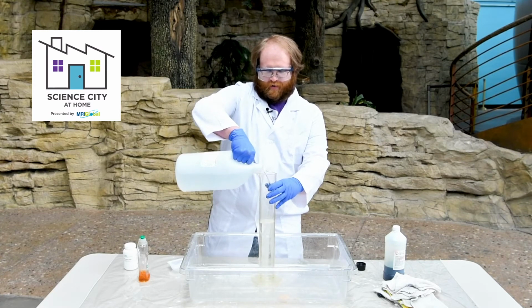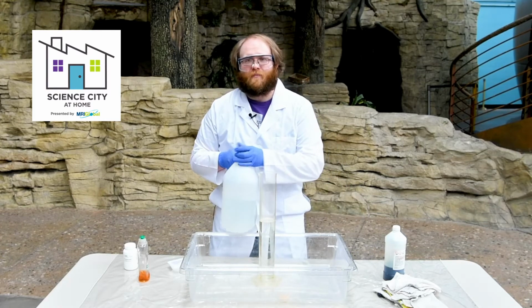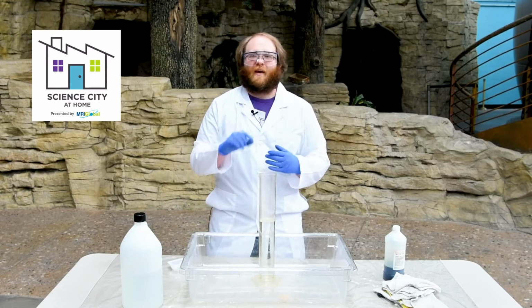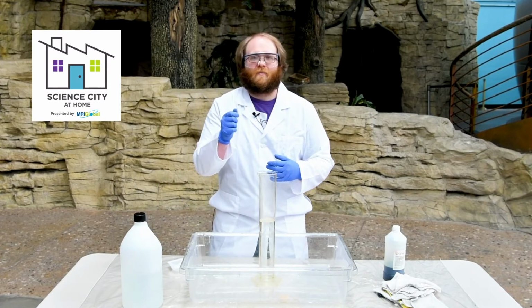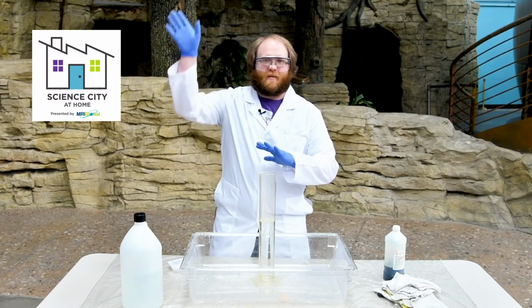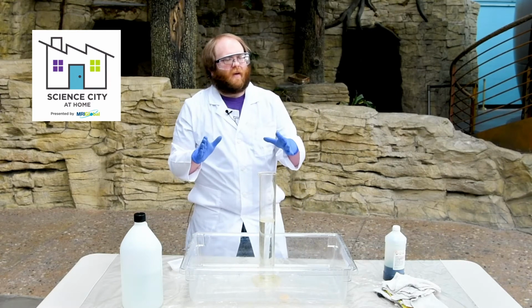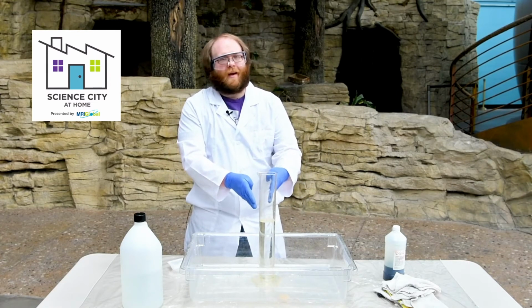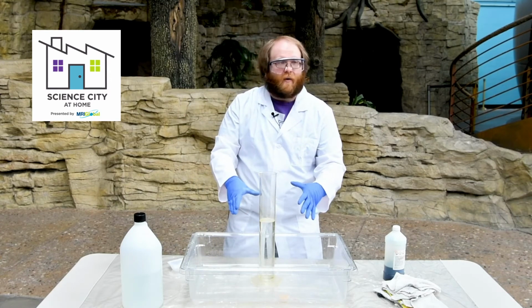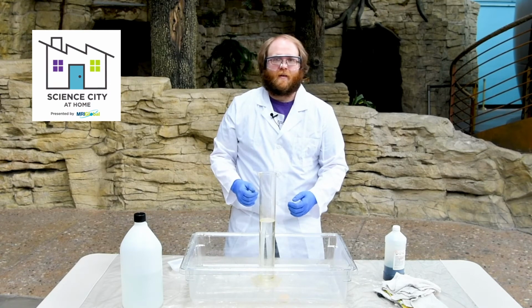Now hydrogen peroxide is very similar to water. Water is H2O. Hydrogen peroxide is actually H2O2, which means it's basically water with an extra oxygen molecule hanging on. But that oxygen molecule wants to get away. It wants to leave, float off into the sky, and just leave water where it was. So another question for you guys, is anything happening right now? If we look at this hydrogen peroxide, does it look like anything is going on, or does it look like a bunch of liquid just sitting in our graduated cylinder?